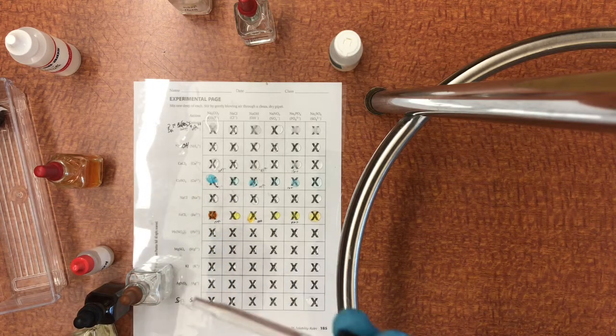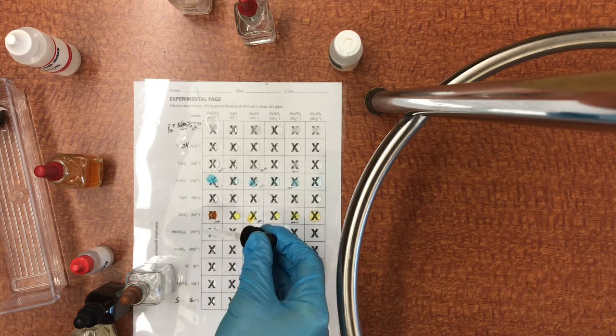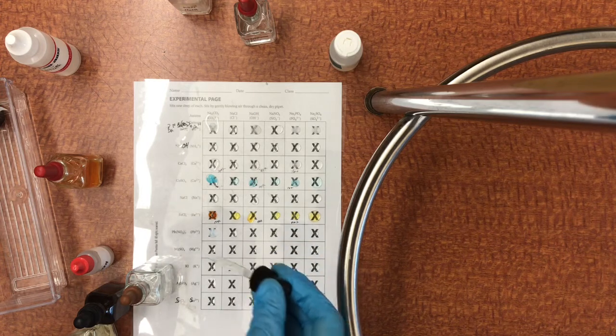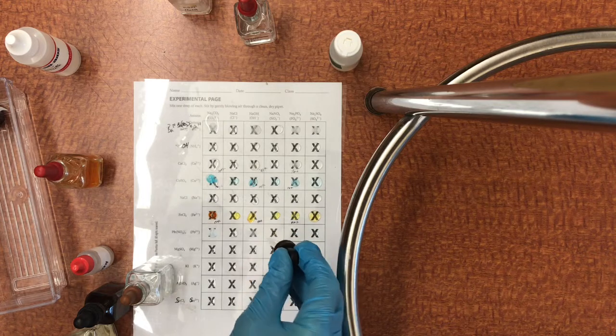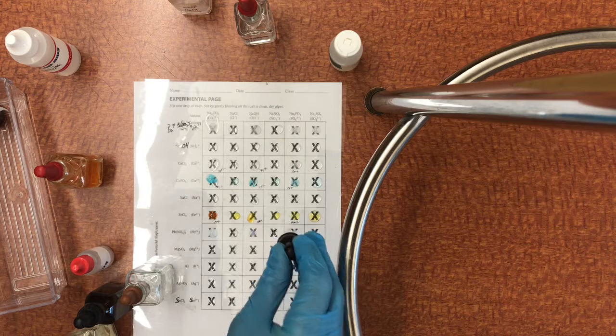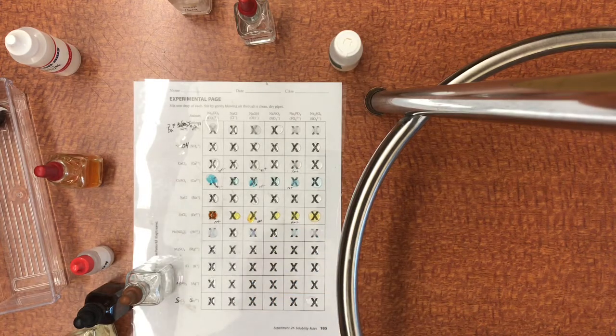Okay, here's my lead nitrate, so it's a clear compound. Distinct reaction. No reaction. Distinct reaction. No reaction. Very strong reaction. Very strong reaction. So lead in general has some very strong reactions.